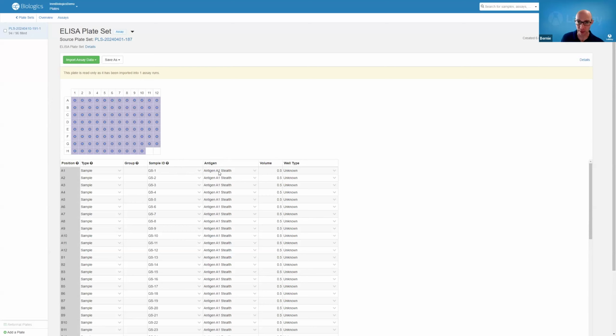I could show you that in a minute, but in the same way that we were looking at that Herceptin Fab before, if there are molecules that you use as things like antigens, you can have those registered as well, and you can capture information against them where you've used them in assays and things. So once I have laid these samples out on my plate and captured whatever information is relevant to me, I can simply import my plate reads. Now I have whatever this is, 7 or 8 plate-based assays configured in here.